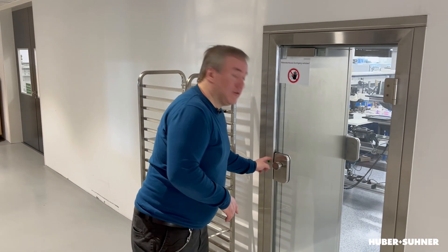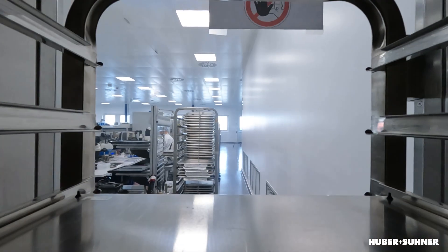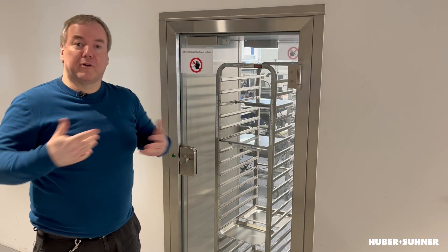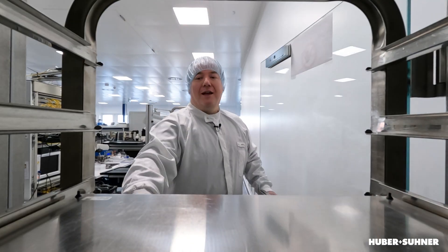I just push the button to unlock the door, open the door, take the trolley, and push it in. Then we close the door and from the inside we can remove the trolley. Let's do it once more — push the button, open the door, and remove the trolley.